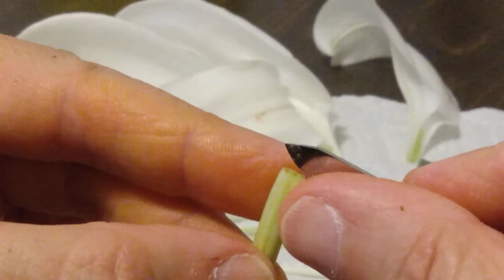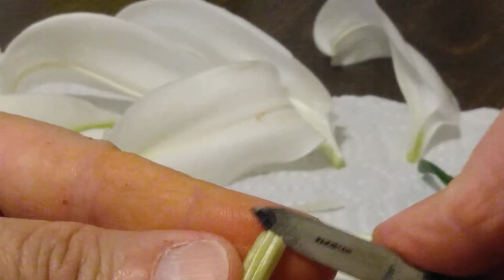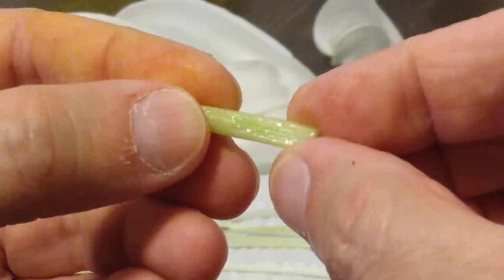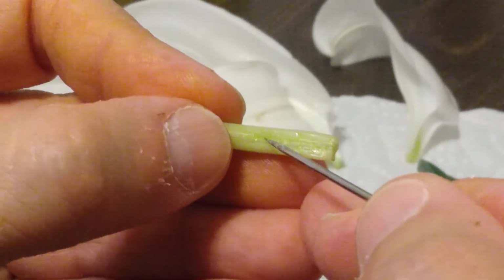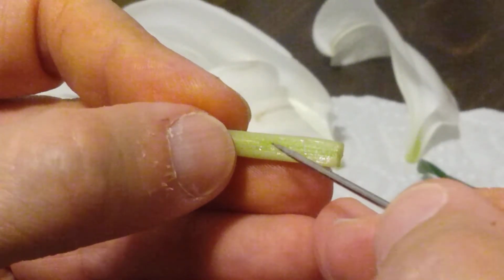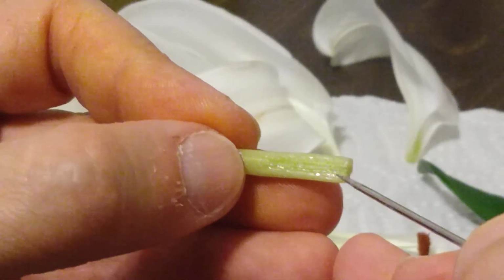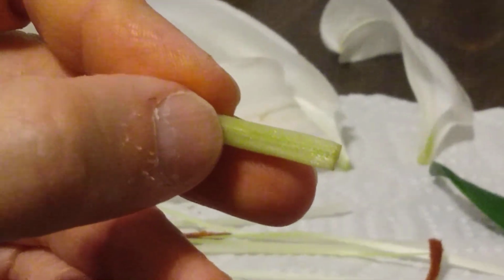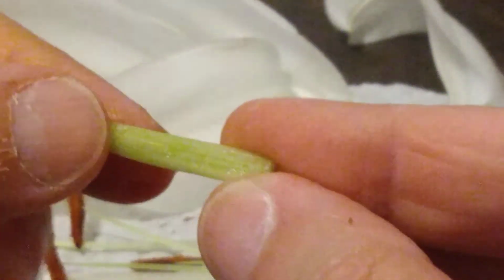And if you want to do that, then you cut this open lengthwise, being very careful with your scalpel here. And when you open it up, we're not going to be able to see it really without some kind of help, but when you look in here and you look along this section right here, you can see the ovules. They're kind of stacked like coins in this case. They're clear looking, so you really need your magnifying glass to look at it. This little camera is not going to focus in on that.